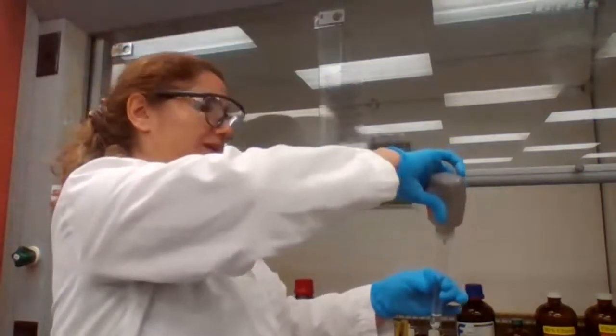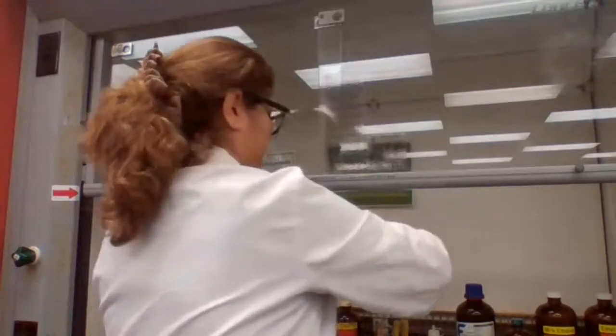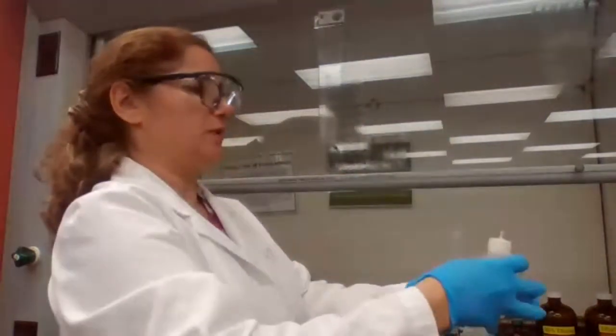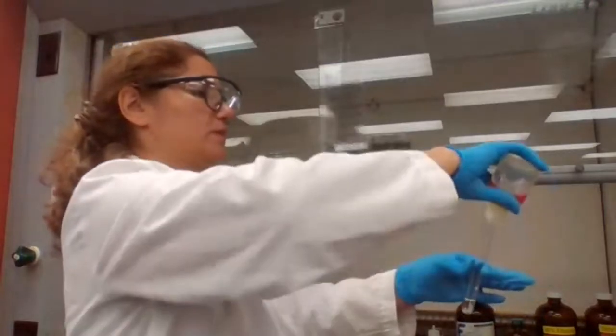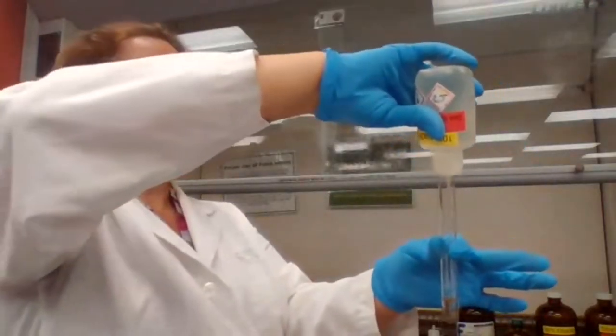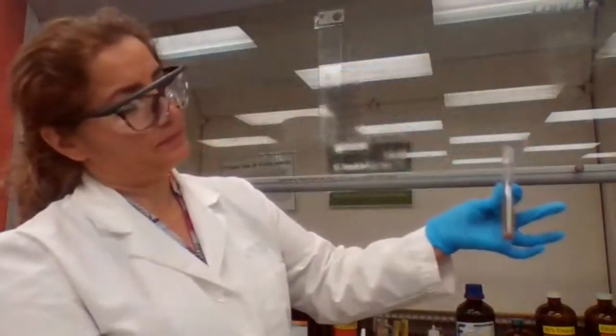I'm going to make it all in one test tube and then divide into different test tubes for the compounds. I'm going to test with the 3 separate compounds. When I add the sodium hydroxide, I get a yellow color precipitate.